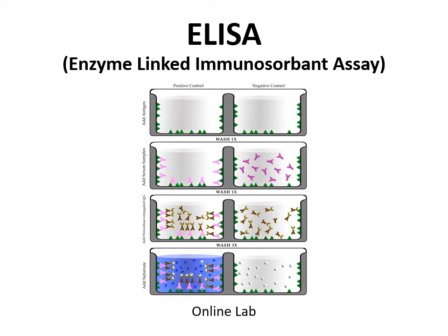Okay, so welcome to the last of your online labs. Since it's the last one, I will try and keep it brief and straight to the point. You are already sort of pros in this area because today we're going to be talking about ELISA, which is enzyme-linked immunosorbent assay, a very valuable diagnostic tool, which is similar to what you've been hearing on the news recently.